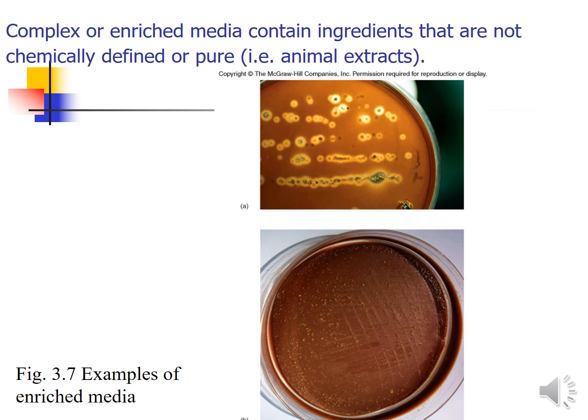This is a complex enriched media containing ingredients that are not chemically defined, that is, they are animal extracts. This is a blood agar. Fine.